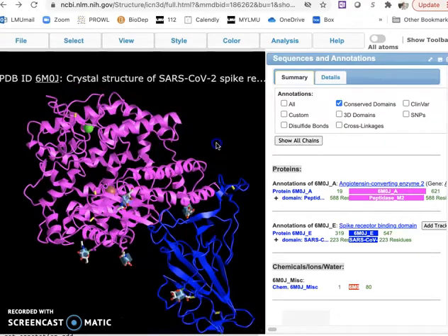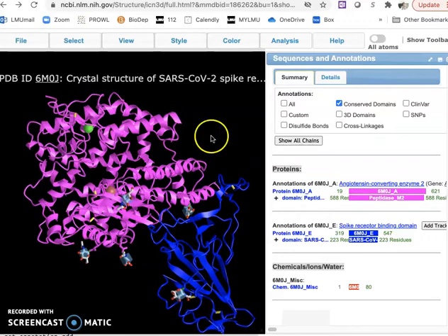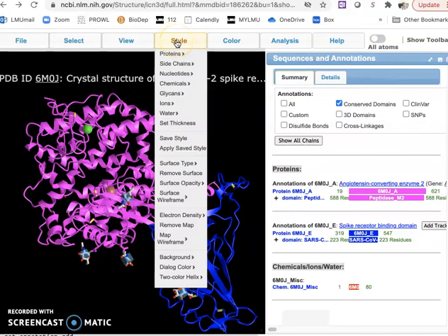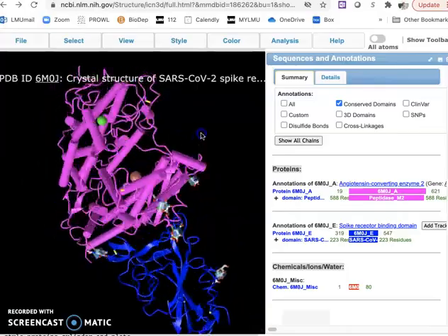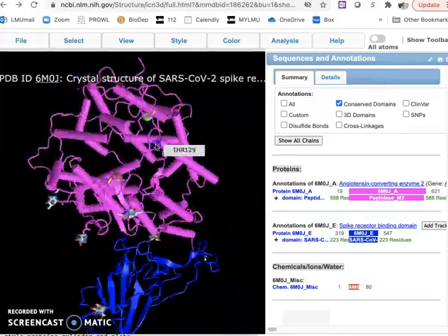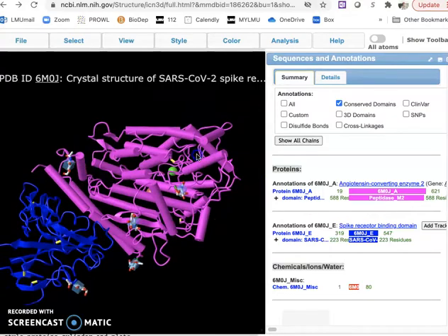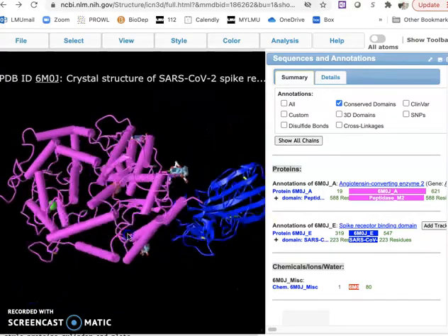Then we explored styles of proteins. This is by default a ribbon structure, which I like quite a lot because it shows the secondary structures of the protein very clearly. Similar to it is cylinder and plate, where you could see the helixes as cylinders and arrows as plates. It's easy to see the secondary structures.